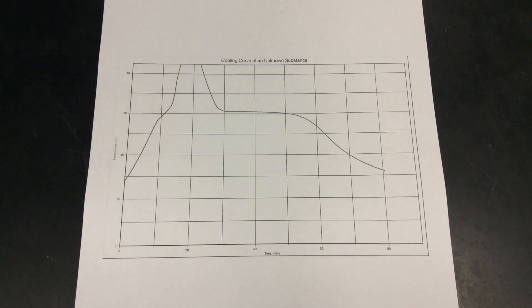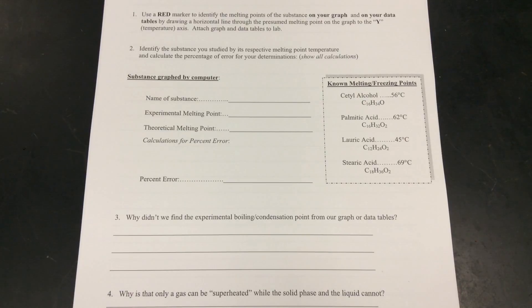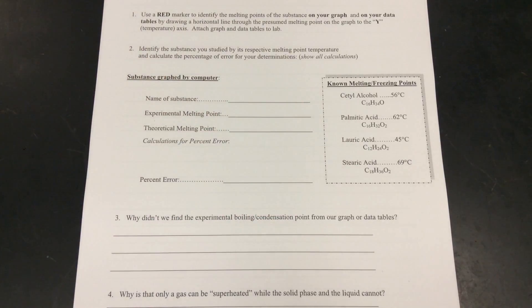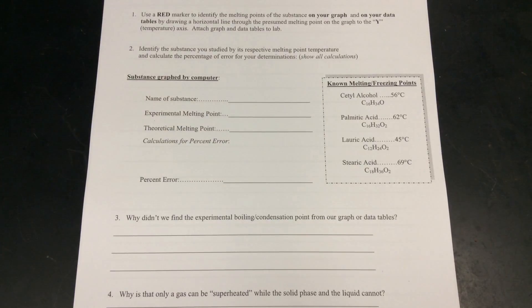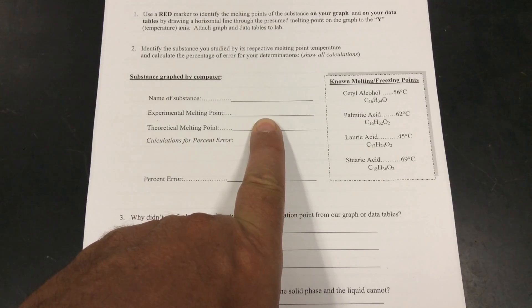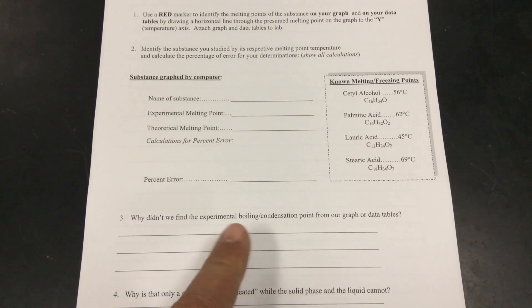Once you've done that, the next part of the lab is to figure out what the composition of your substance is by your experimental melting point. When we look at our conclusion page, the substances that we test in lab were one of the four substances. Based on your experimental melting or freezing point, you try to identify what the substance in the test tube was. Clearly, we have your experimental melting point that we just determined from our graph and our data table that should go out to one decimal place. We're going to see which one it is closest to. You're going to name the substance based on which one it's closest to. The theoretical melting point, of course, is these known values here. And then we'll do a percent error.